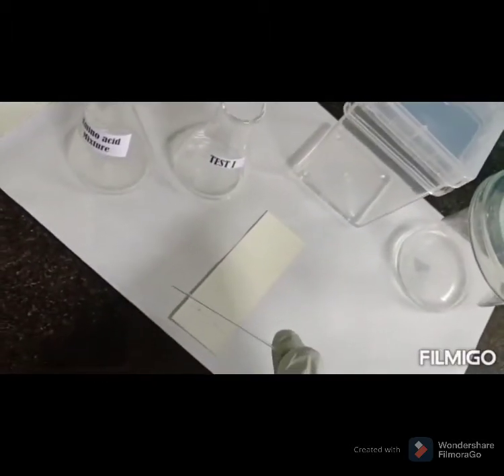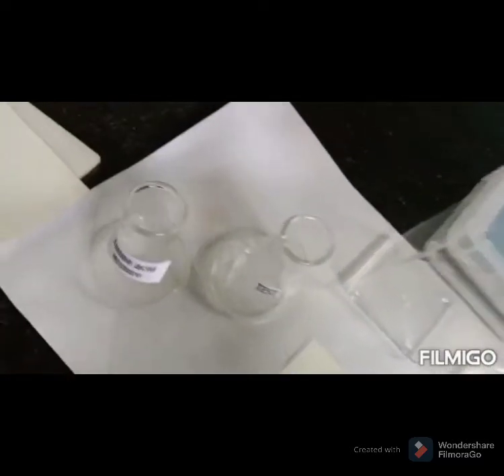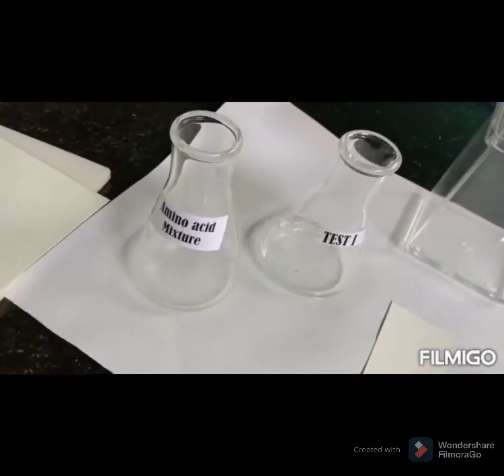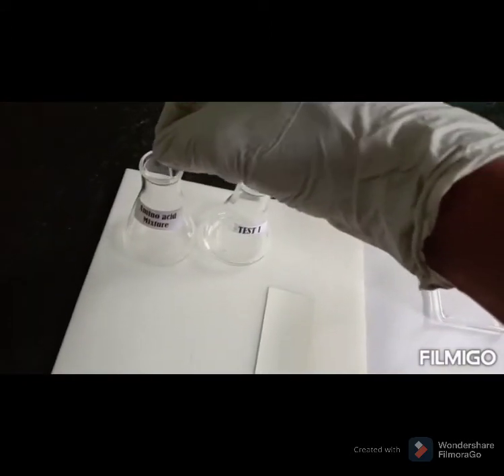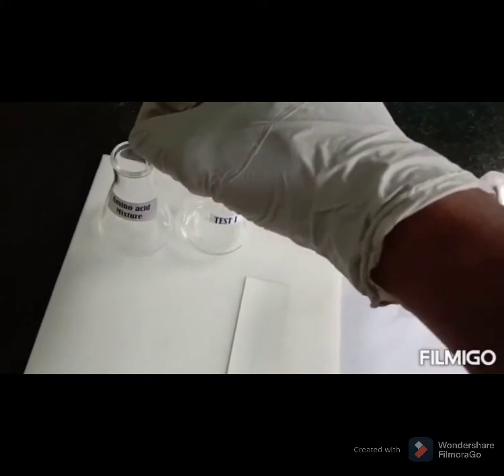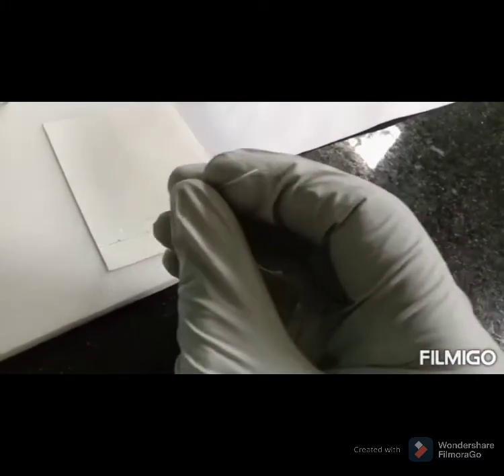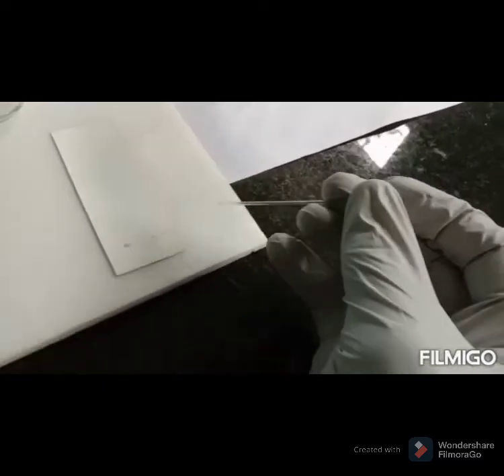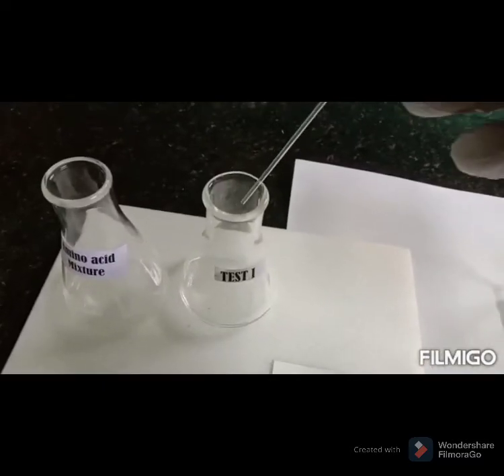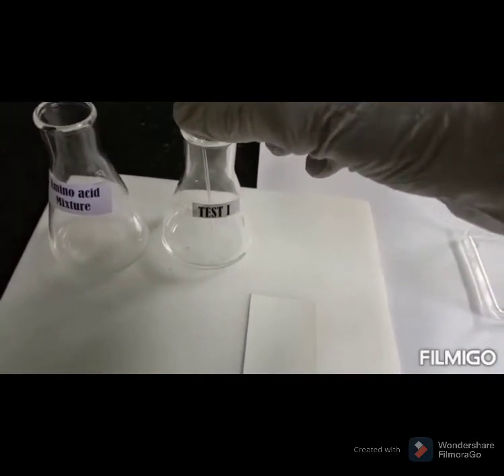One is a mixture of two amino acids, and the other is a test solution containing only one amino acid. A small concentrated spot of solution is applied to the points using a capillary tube for maximum precision. The first is from the mixture, and then the test sample is also added.